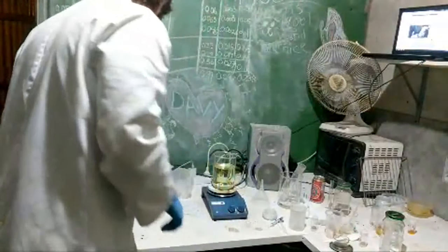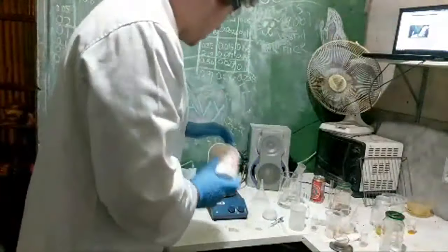Breaking gas. What are you even doing? Oh, so I'm making ferrate, which is high oxidation state iron. So we've got bleach, we've got iron oxide, and that's about as far as we've got within about an hour's work. So, beautiful, beautiful stuff. All star.